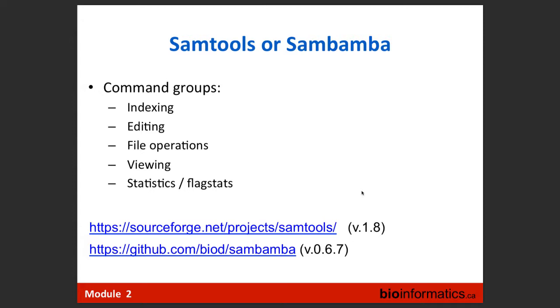These are tools which we use to manipulate BAM files. One is called SAMtools, and another, more recent tool, is Sambamba. The advantage of Sambamba is that it uses multi-threading, so since any server now has multiple cores, you can run your program simultaneously on many cores. You can have like a 10 times speed up of your analysis time. But for small jobs, this is pretty good.